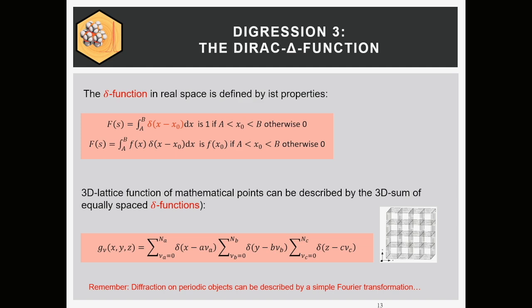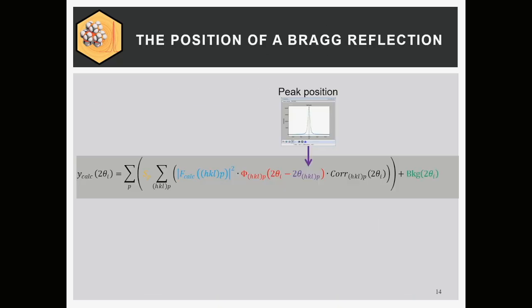This function, called the lattice function G, describes a mathematical lattice. Again, nature is not making lattices. We make our life simpler by taking out the content of one unit cell and having this infinite mathematical lattice here, and then just convoluting these two, which gives our crystal structure.